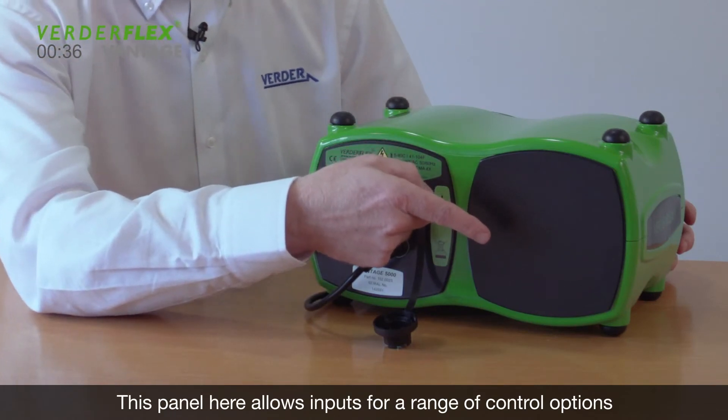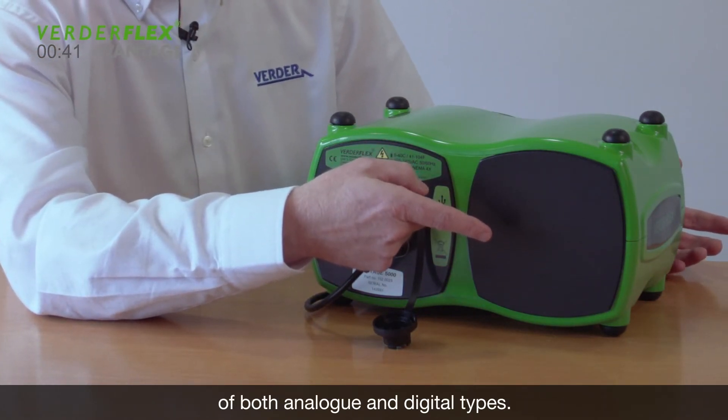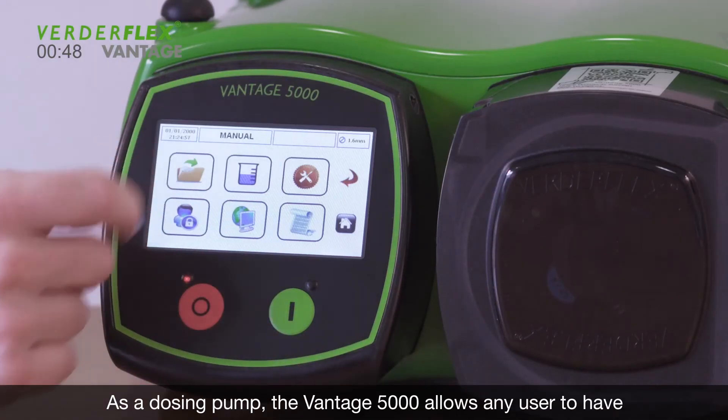This panel here allows inputs for a range of control options for both analog and digital types. The pump can also be monitored via an app which can show the various users' performance metrics.